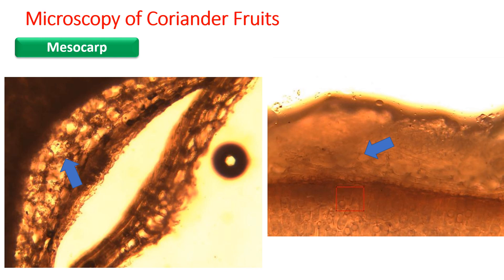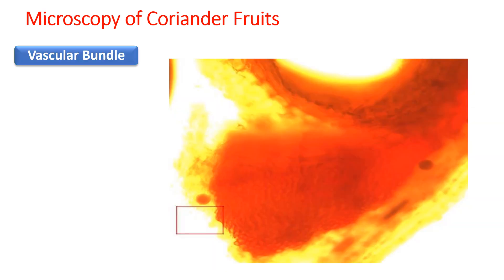About the mesocarp: in this region you can find two different zones of mesocarp. Looking at this region, this is one zone of the mesocarp followed by a sclerenchyma layer and then again another zone of mesocarp. Similarly here, this is the inner zone and the outer zone, divided by a sclerenchyma layer.